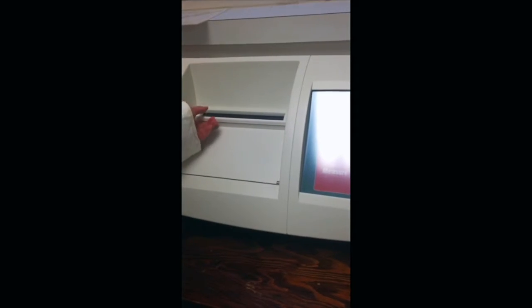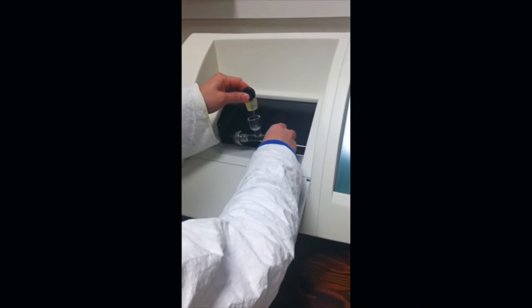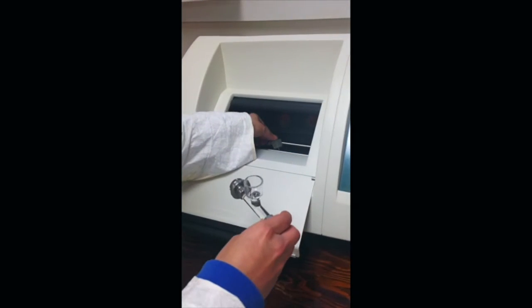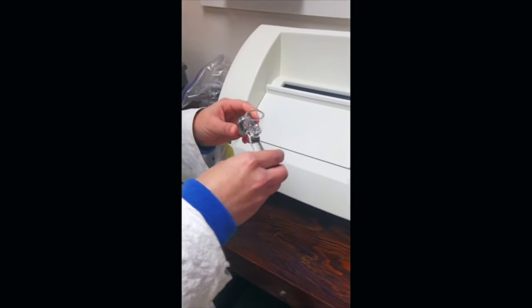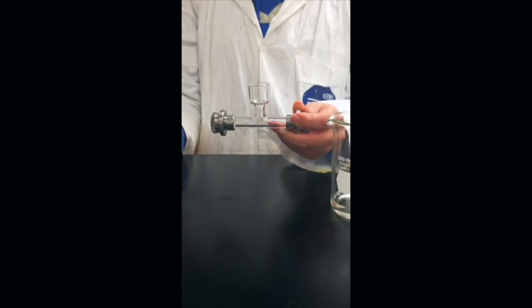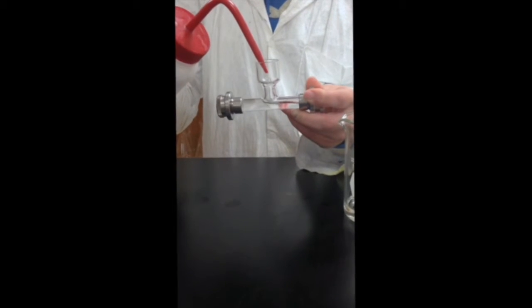I'm going to demonstrate how to clean and use the polarimetry cell. Remove the cell from the instrument and insert the temperature probe in the instrument. Rinse the cell 3 times with the wash bottle acetone.